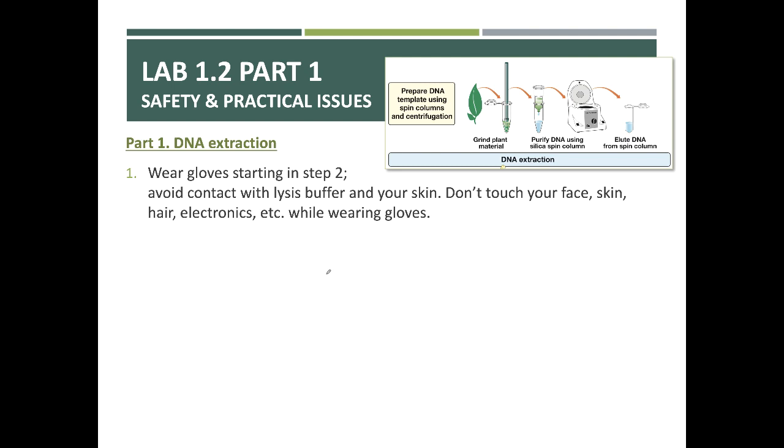Some of the research we do, we don't always have to wear gloves, but in other areas of research you wear gloves. And anytime you're going to do PCR, you always wear gloves. The reason is that in this particular experiment we're trying to amplify DNA found in plants. We don't want to amplify DNA found in our own skin or the bacteria that happen to be on our skin. We want to make sure what we're amplifying is coming straight from the source we're interested in.